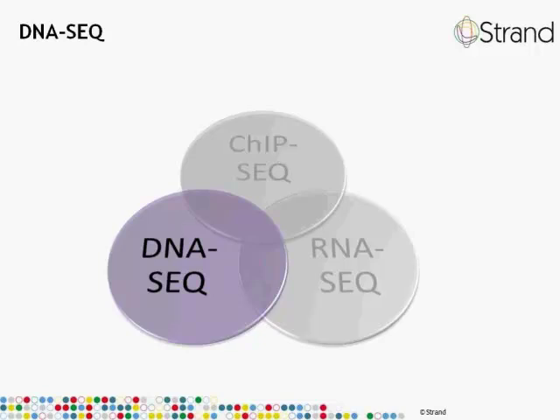Of course, for cancer biologists working with NGS data, a key set of functionalities would lie in the analysis of whole genome or exome data from cancer tissue, comparing it to blood or normal from the same individual, or normal members of the same family, or even another normal person. These various comparisons would help identify structural variants and small polymorphisms in the genome which are critical for tumor development, or those that are inherited, and so on. We will talk about various available functionalities in the DNA-Seq module of Avadis NGS that will aid the cancer biologist.